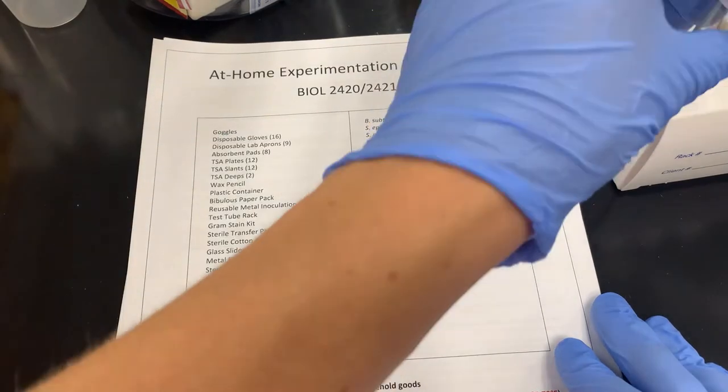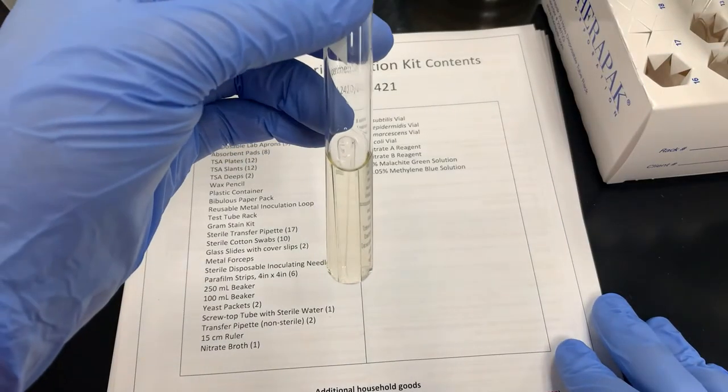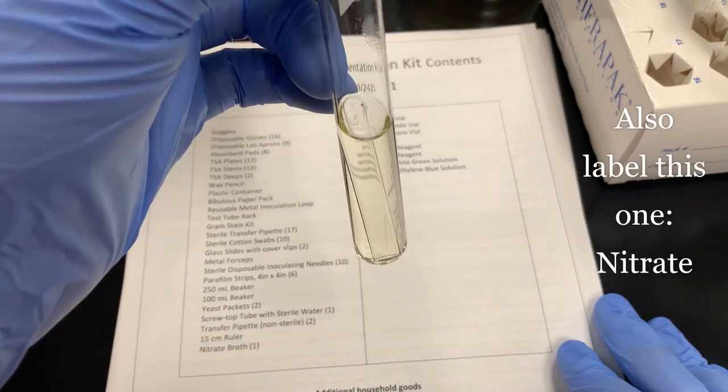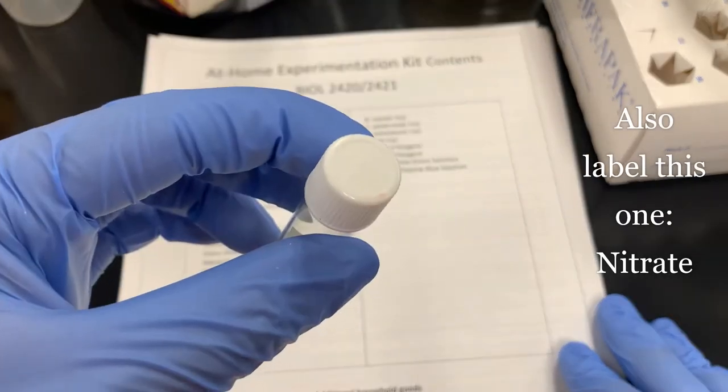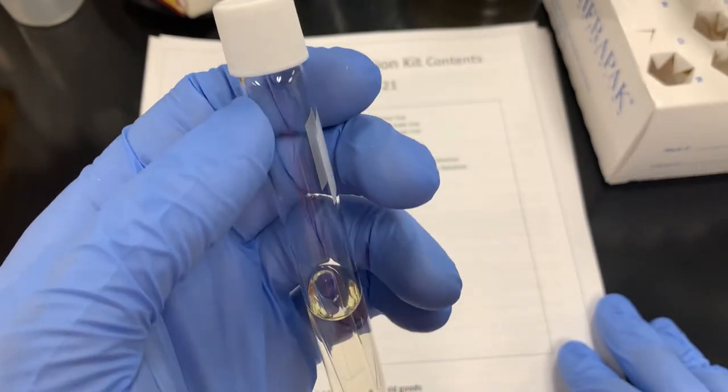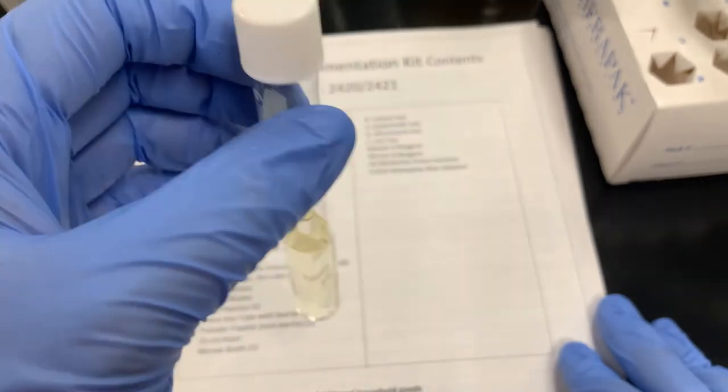Then we get the nitrate broth. Nitrate broth also comes in your disposable test tube rack. It has a glass tube in there. It's called a Durham tube. It's going to capture gas from bacteria. It also comes as a screw top. All the tubes this semester come as screw top to keep them sterile and leak proof in your kits.